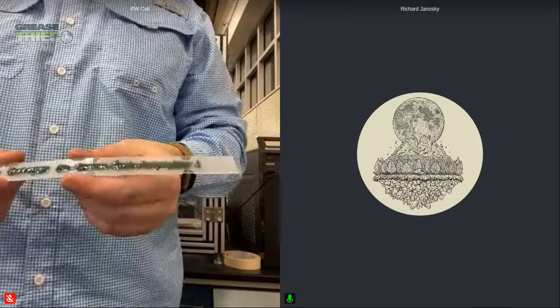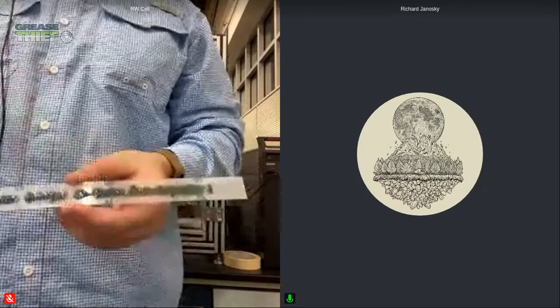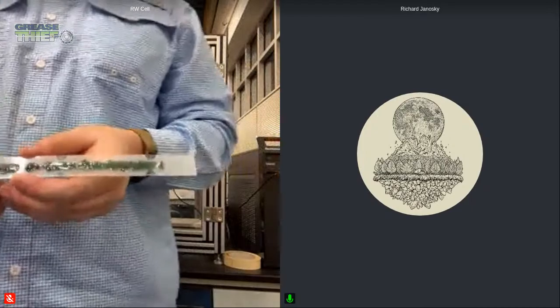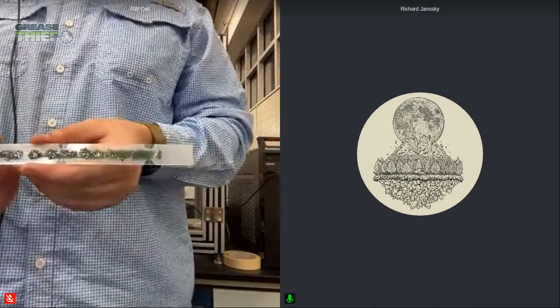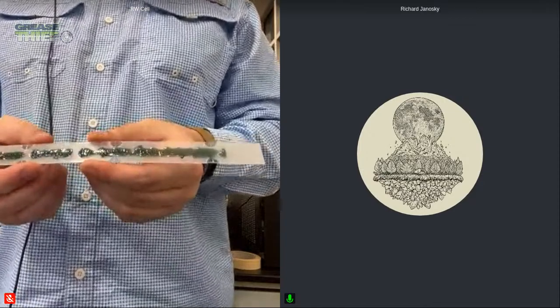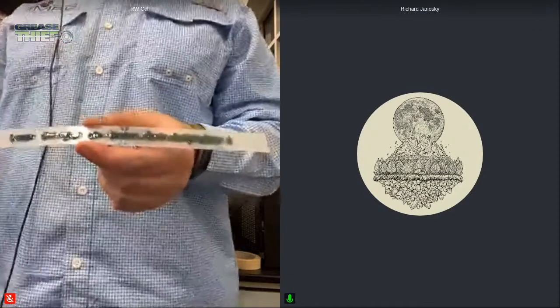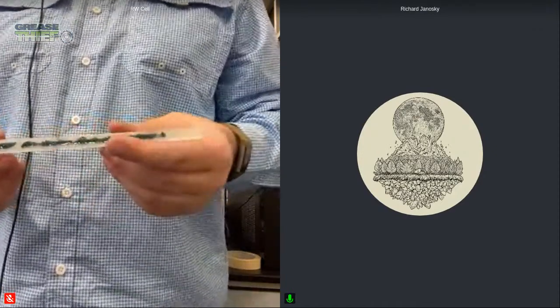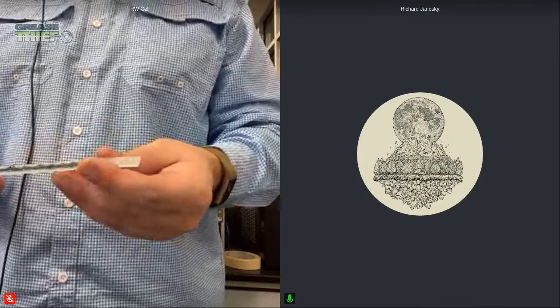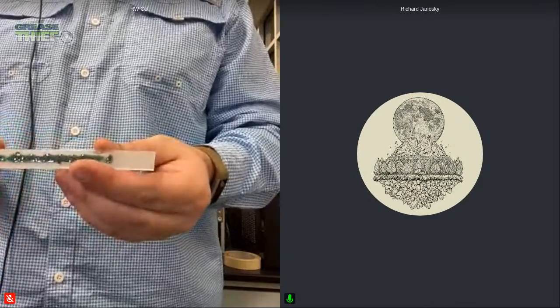And what we'll see in the extrusion profile is we'll see a dip in force. And with the software, we're able to select or deselect that data and make sure that it doesn't count against the load profile of the grease. And then we don't have an influence of air making the grease look like it's softer over the average of the force reading. And then, as Rich mentioned, if it's a full grease strip, so down here on the end, I have a nice run. There weren't any air bubbles.